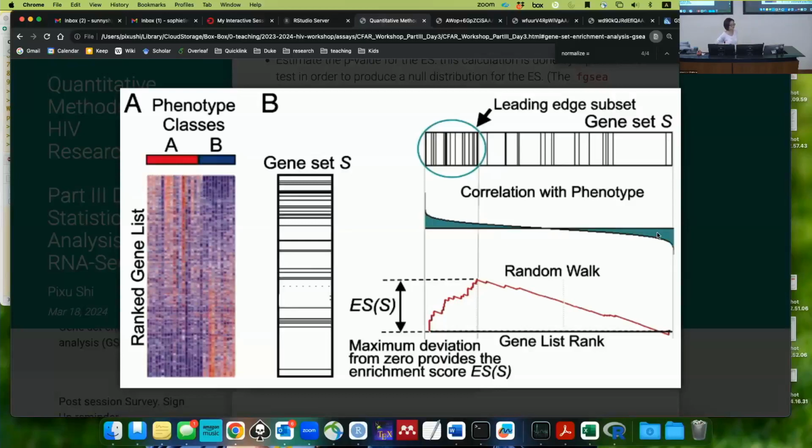This was just a pilot run, you know. I had about 2,000 genes. It wasn't a real experiment with proper controls. I was just curious if just looking at the whole thing would give me some information. In your case, DESeq won't even run. So the fold change you have you can calculate manually by taking the ratio. That's what I want to try to come up with.